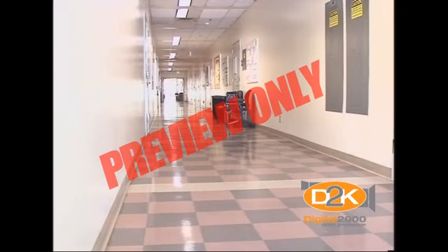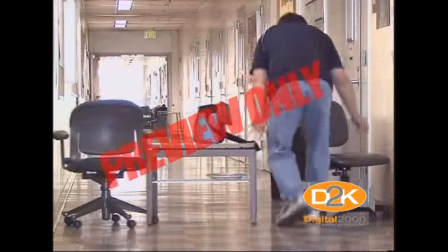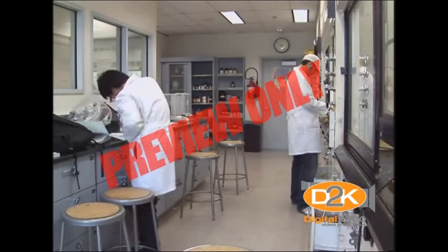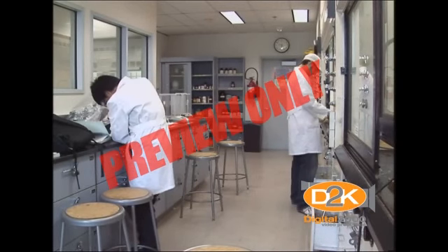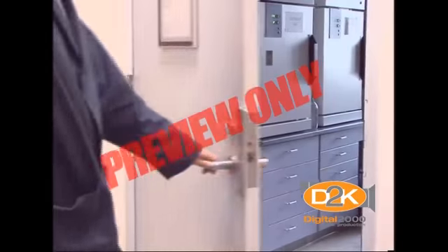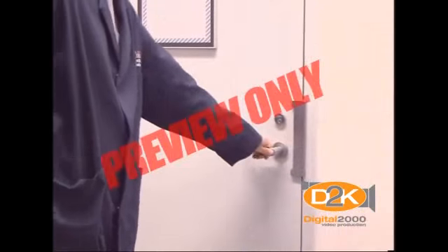Passageways and aisles must be a minimum of 36 inches wide and must remain unobstructed. The location of emergency exits for each laboratory and laboratory support room must be clearly marked. Exits, stairs, and passageways should be permanently illuminated to facilitate evacuation in the event of an emergency. Emergency exits must be clearly marked. Fire doors must remain unobstructed.